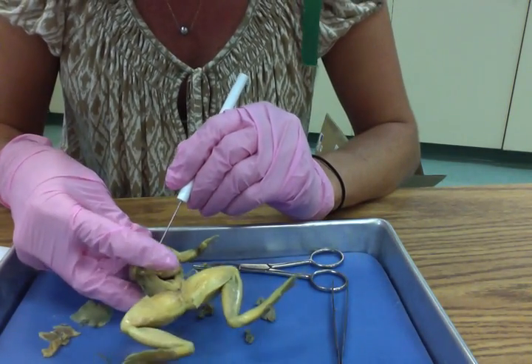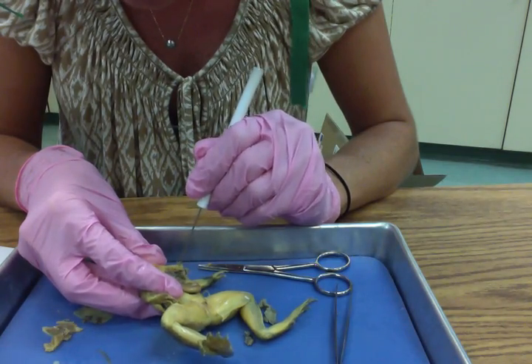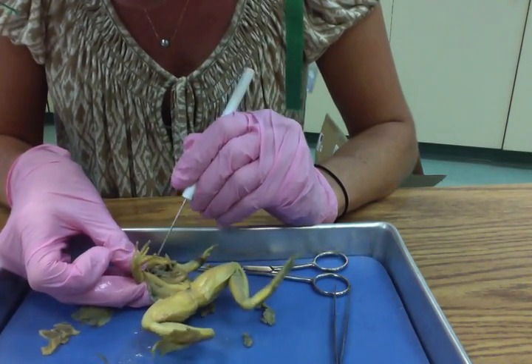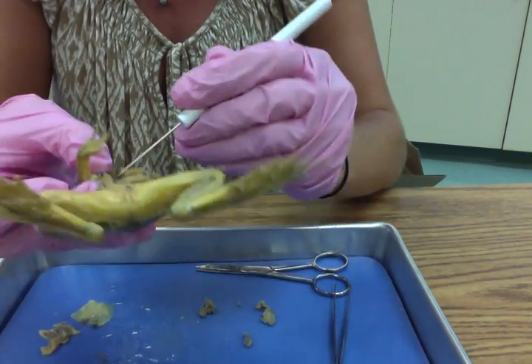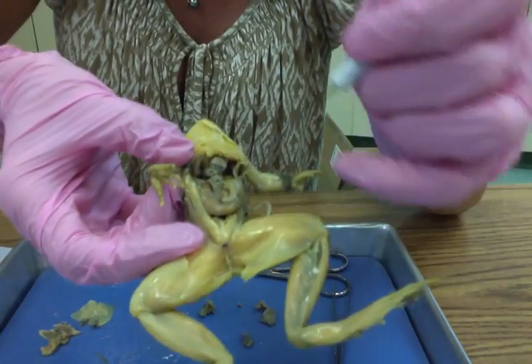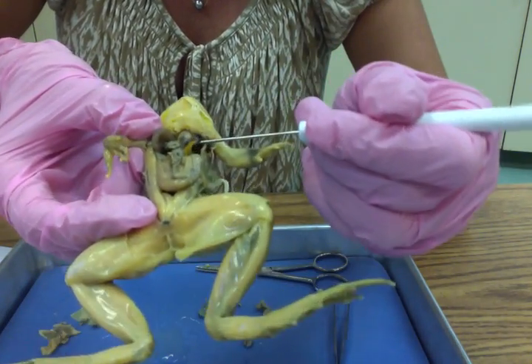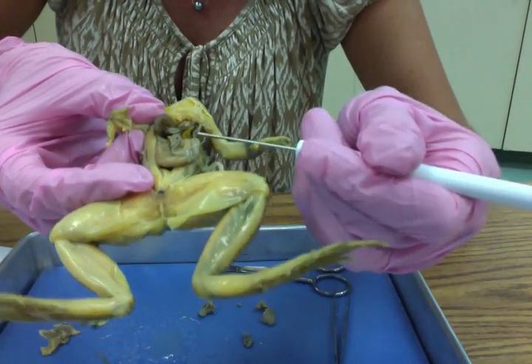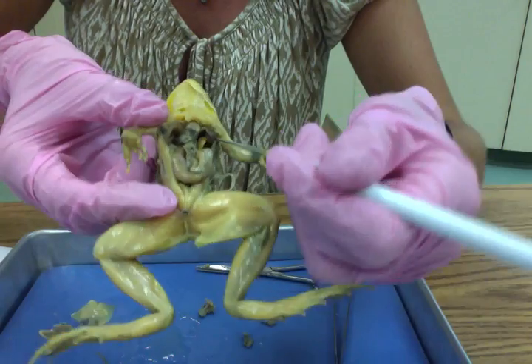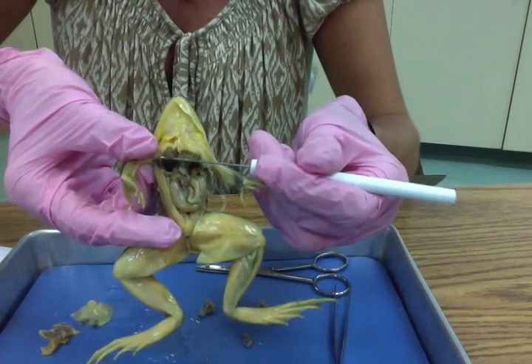On either side of the heart, you should be able, let's see, where's my lungs here? Well, there they are. They're kind of deep in there actually, so you might have to kind of dig into the body cavity a little bit. There we go. And you'll see these kind of pinkish, brownish, spongy structures on either side of the heart. So right here and right there.